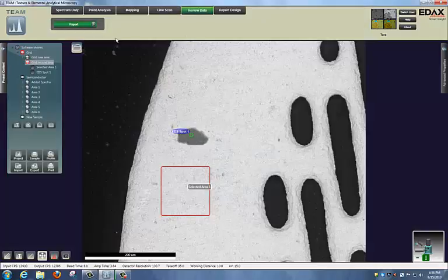This will conclude our spectrum-only and point analysis activities in the activity bar.